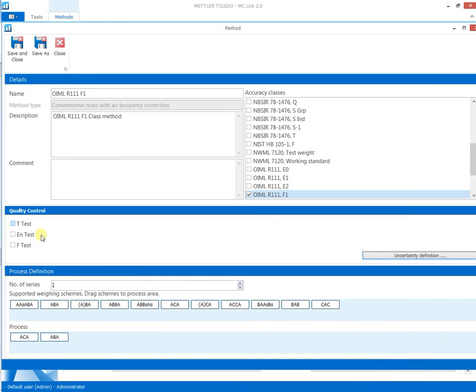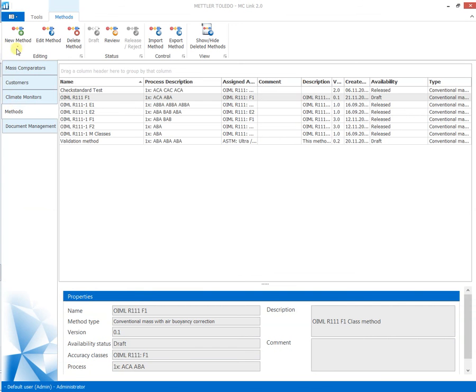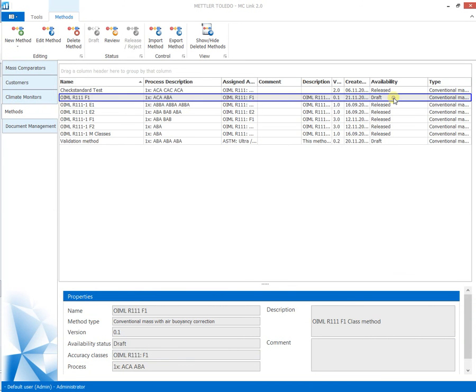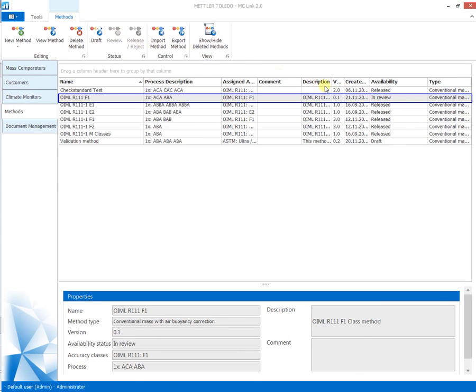The integrated quality assurance tools grant high data security at all times by evaluation of historical data in combination with actual process data. The generated method is to be released by another user with sufficient user rights, thus assuring full data security.